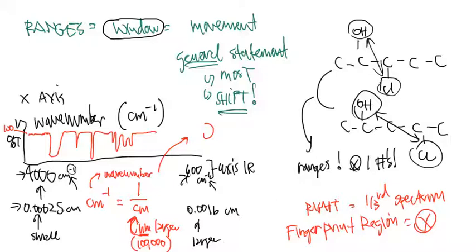And there's just too much going on in there. So I never really take a look at the fingerprint region and try to pinpoint what each one of those spikes are leading to, or what each one of those represents as far as functional groups go. The fingerprint region happens in a specific area, and that is 1400 to 600 wave numbers. That is my fingerprint region.